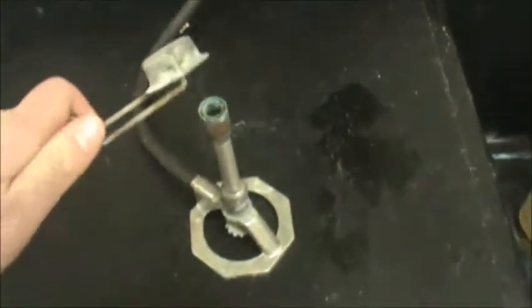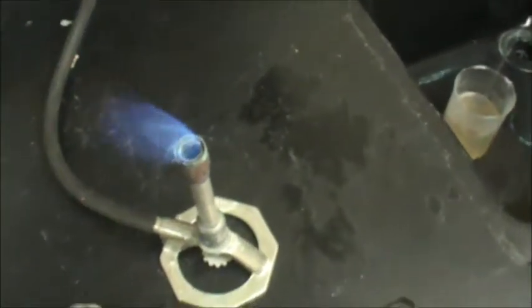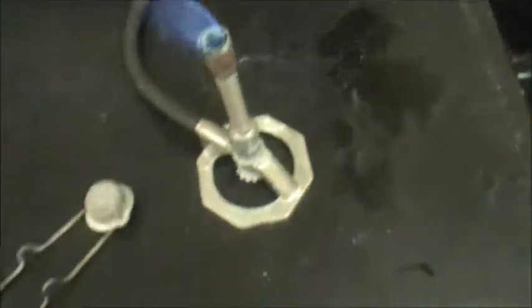Let's do this. Got my Bunsen burner. Start it up. Yep, my gas is just a tad high, and there's a breeze in here. I'm going to take my steel wool with my crucible tongs. Alright, you notice that steel wool is a solid at room temperature. It's not flowing out of the tongs, and let's watch what ends up happening here as I place it in the flame. Whoa! Totally have sparks flying.